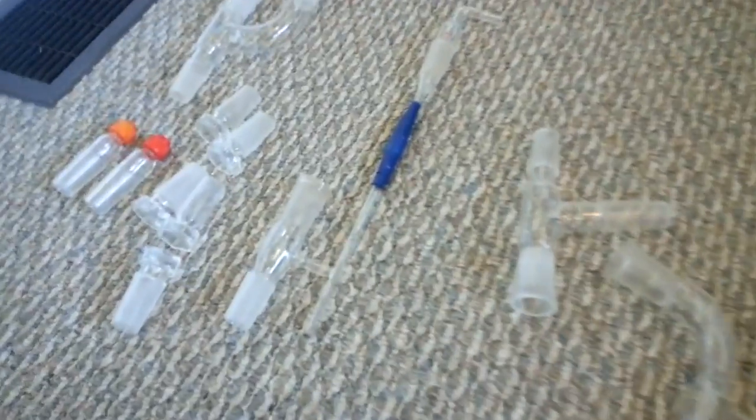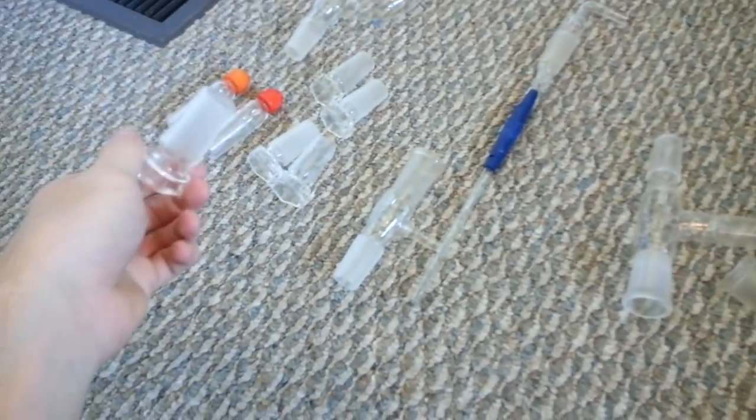For connectors: these connectors are pretty cheap and very good to have because you need them. These things — I have five of them — are just little stoppers. They just go in and block stuff off. Pretty simple.